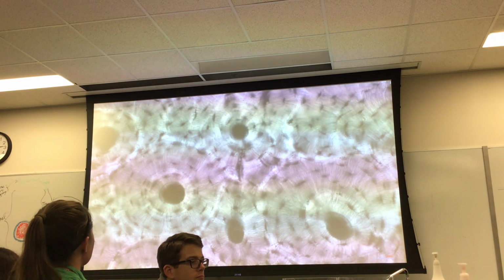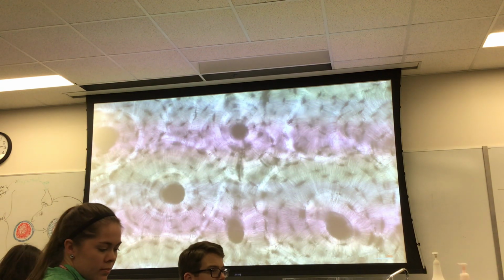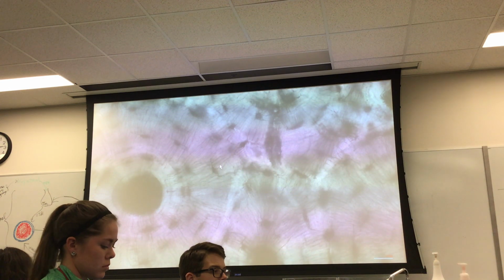Okay, so dried ground bone. This is the one where you see these black things here. Those are called, let's look at this in higher mag. Those guys are called lacuna. So that is a lacuna. These little guys right here are called canaliculi. So the cells that lie in lacuna are called osteocytes.